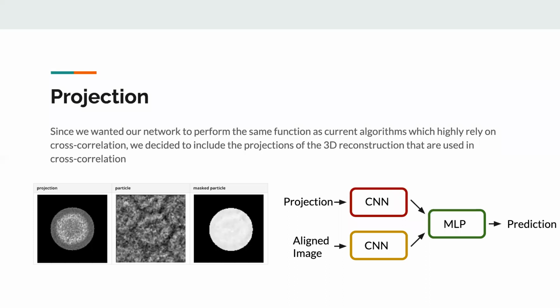While this gave us good results during evaluation, a major problem with this approach is that when shifting the frames during alignment, the realigned frames will produce a different reconstruction and thus different projections. Because of this, we did not use this model for alignment.